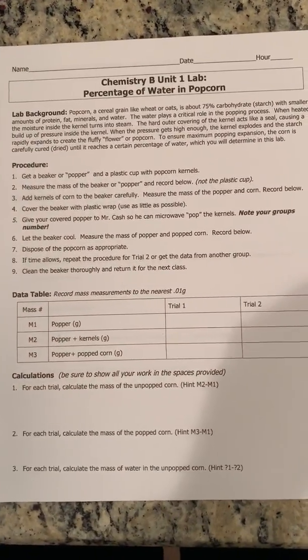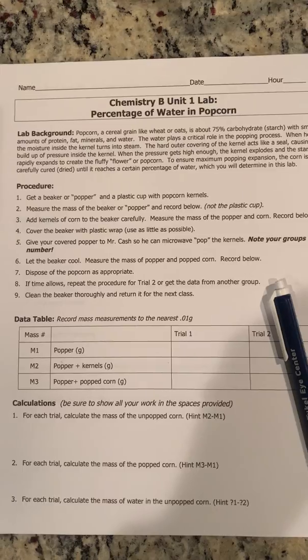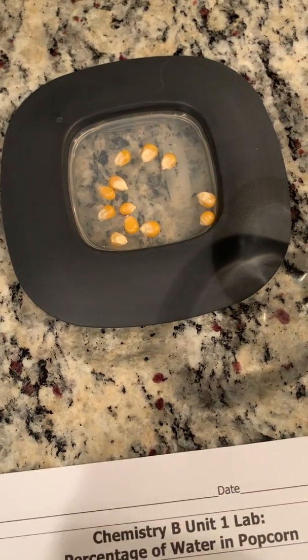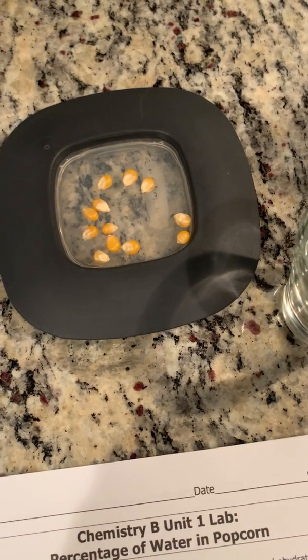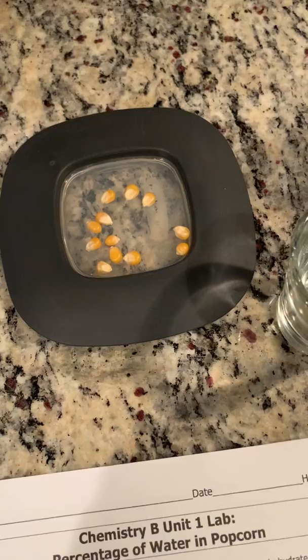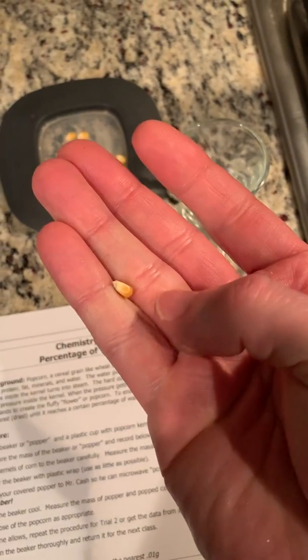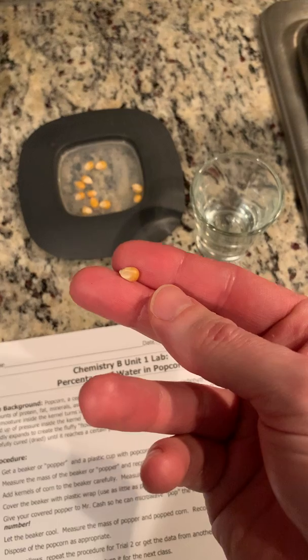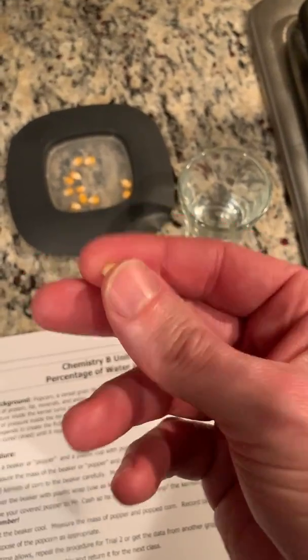So if you take a look at the lab, please read through the background. The gist of what it's saying is you may or may not have really thought about popcorn too much. Most of you probably know that it comes from a kernel, but how it goes from that to that big fluffy white treat — versus one of these guys that could potentially break a tooth — is there's a little bit of water in there. You pick one of these up and it certainly appears to be solid and it's not squishy. That's because of this process called curing it — basically they dry it out and try to reach a certain percentage of water. If there's too much water it's squishy and it'd go bad, and if there's not enough water, the popping can't occur.